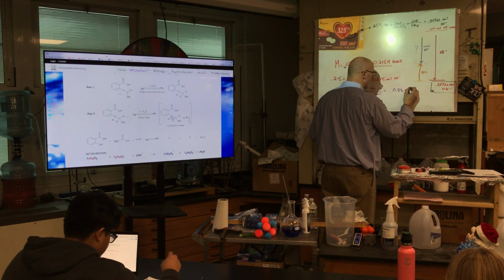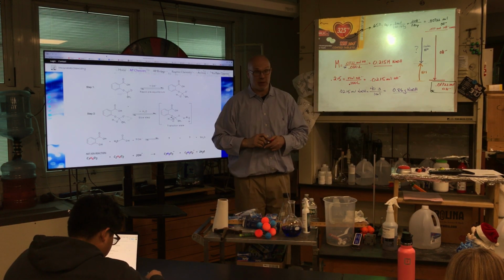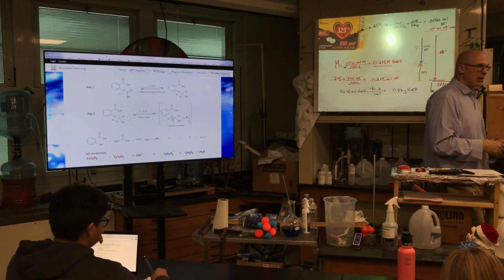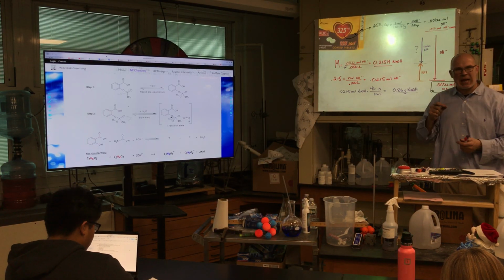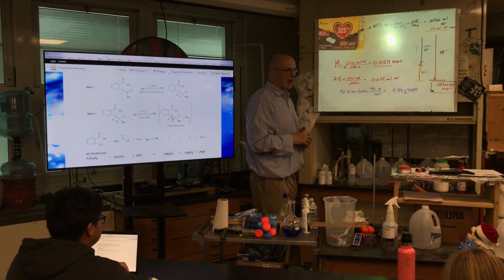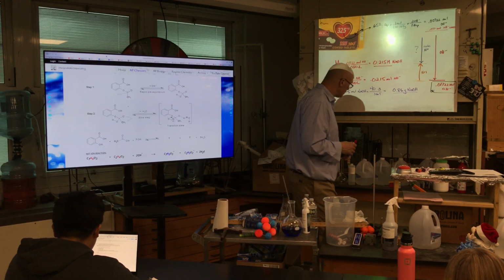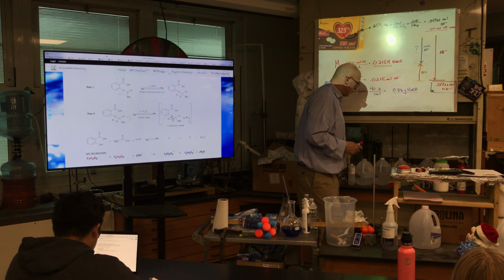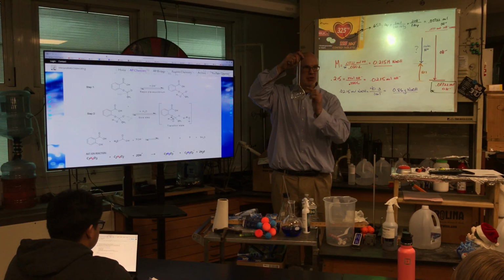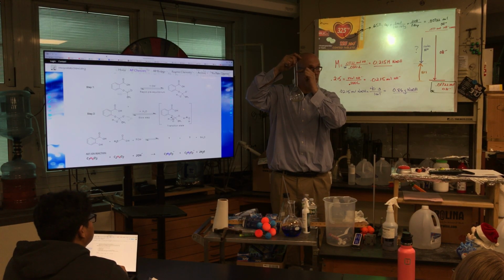0.86 grams of NaOH. And tomorrow, you're going to carefully measure out exactly 0.86. You're going to have to crush the tablets and use pieces of it and spend the time to make that. Now, what do you do with that? You're going to add it to a 100 milliliter volumetric flask. Make sure you get all out, wash bottle. And then you're going to dilute to the 100 milliliter mark.